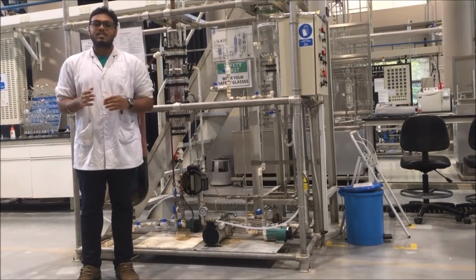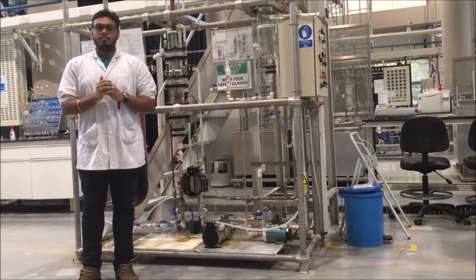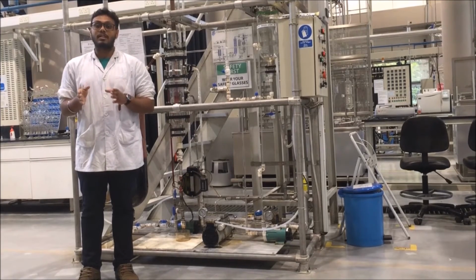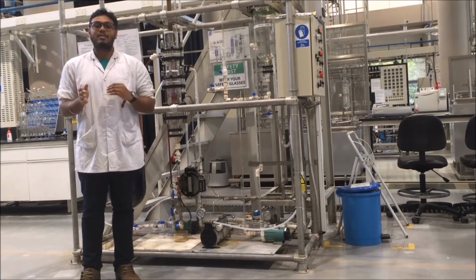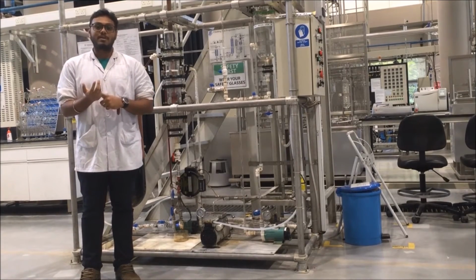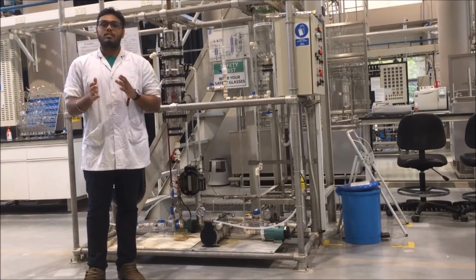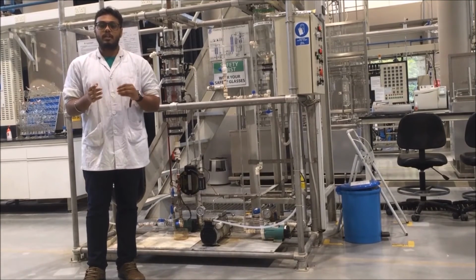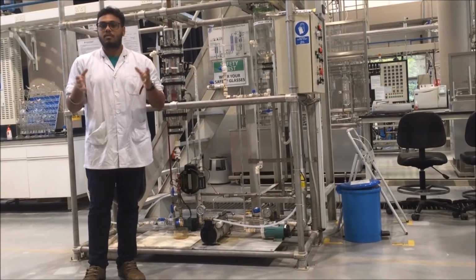After collecting the samples, we are required to get the refractive index through the refractometer. To get an accurate reading, we have to make sure the refractometer is cleaned completely with distilled water. In both parts of the experiment, we are required to record the time taken for the first boiling bubble and also the multiple bubbles. While recording, the same person should observe and record the time to make sure there are no different judgments in the later part of the experiments.